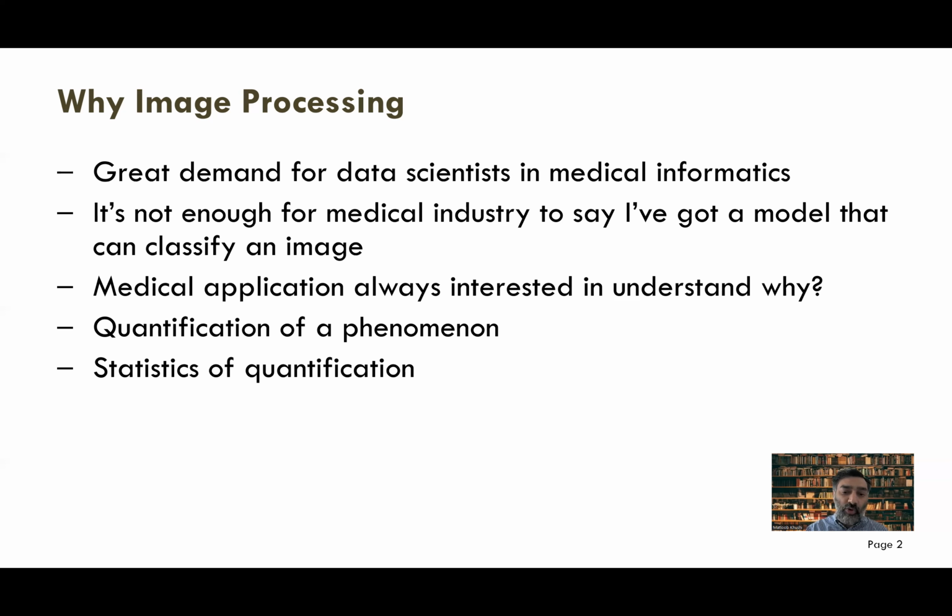We need to quantify the images and say with numbers how much bigger: 10% bigger, 5% bigger, 20% bigger, or smaller. And then you also need to show whether this change in size, or whatever you're measuring, is significant enough to show the efficacy of a drug.